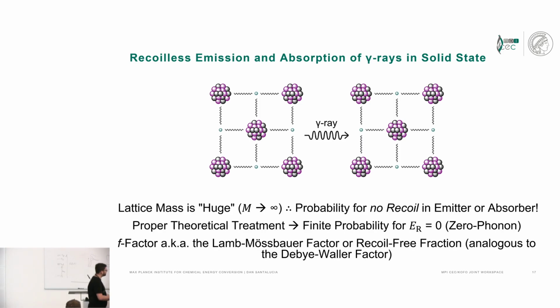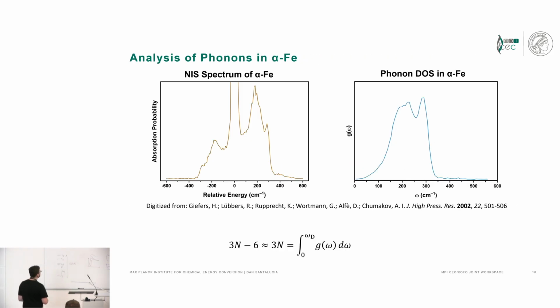A more proper theoretical treatment is this. Again, the zero phonon idea involves this sort of Lamb-Mössbauer factor, or recoil-free fraction, which is analogous to this kind of Debye-Waller concept that Serena brought up in her X-ray talk. But I just want to talk about phonons a little more.